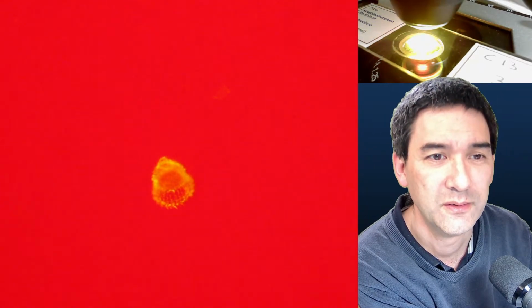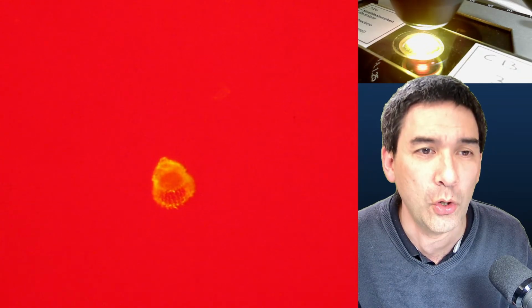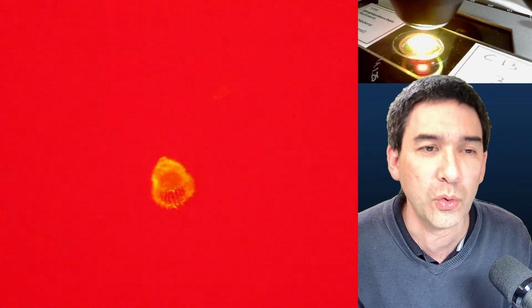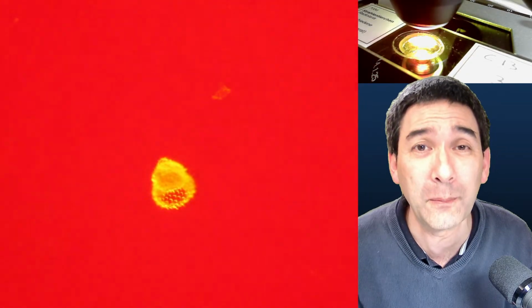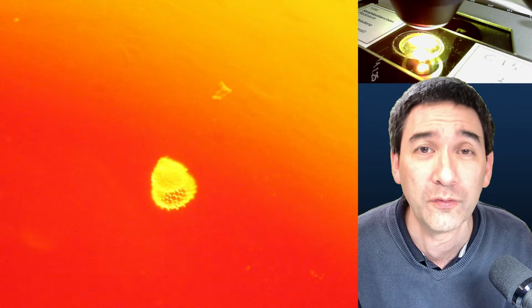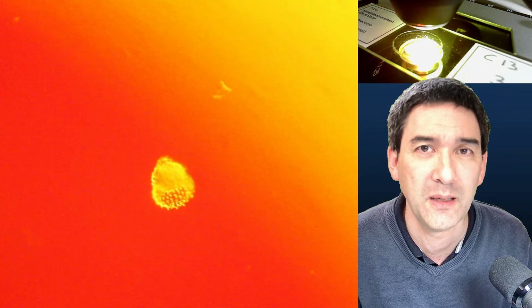So it's quite nice. One thing I did not try yet, but this has also been a recommendation or comment, is that if you use polarization filters, then there are so-called lambda fourth plates, or retardation plates. What they do is shift the wavelength by a quarter of a wavelength, and apparently with those you're also able to do a little bit of color changes.